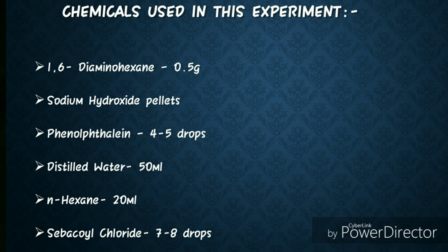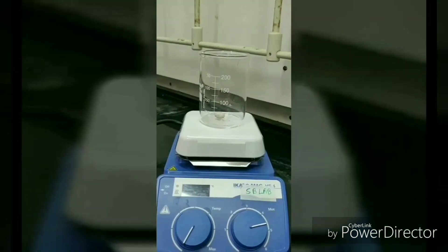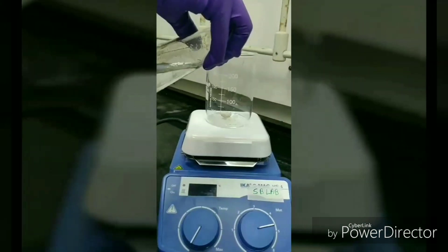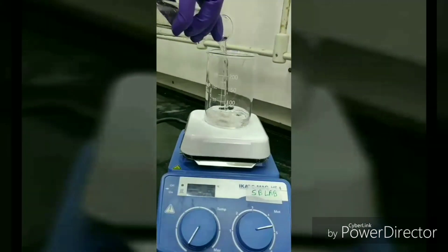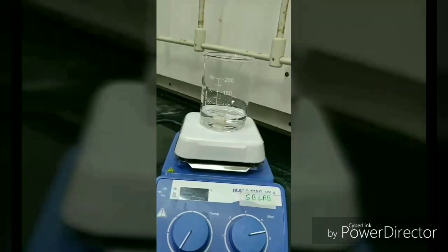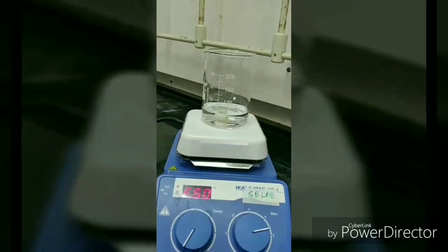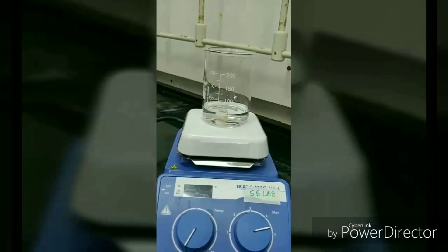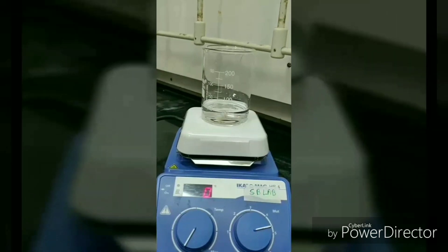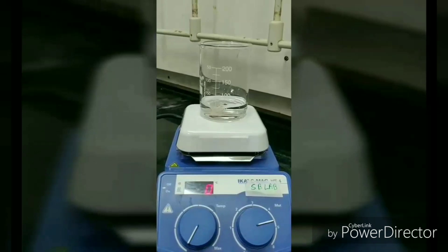We have taken 0.5 gram of 1,6-diaminohexane in a beaker and added 50 ml of distilled water to it. To dissolve the 1,6-diaminohexane in water, we place it on a magnetic stirrer.